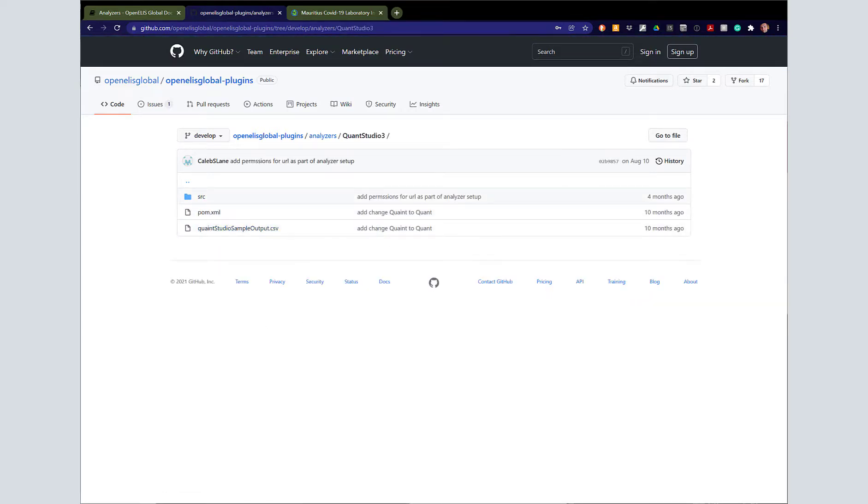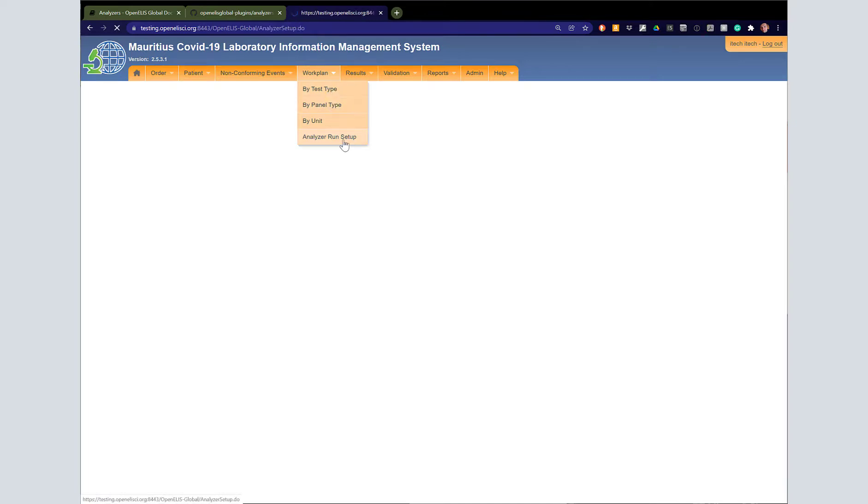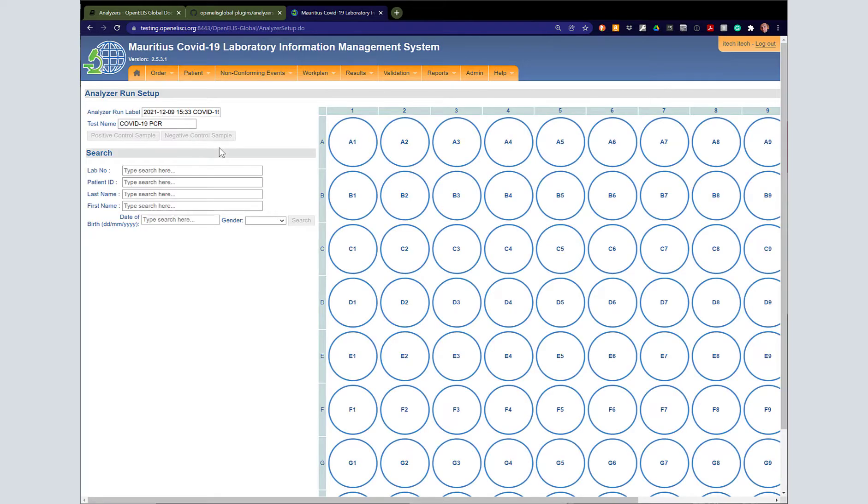Here you can find the QuantStudio plugin where you can compile it, and then you're able to actually do an Analyzer Run setup from within OpenAlice. We'll select QuantStudio 3, which is the same format as QuantStudio 5, the 96 well option.